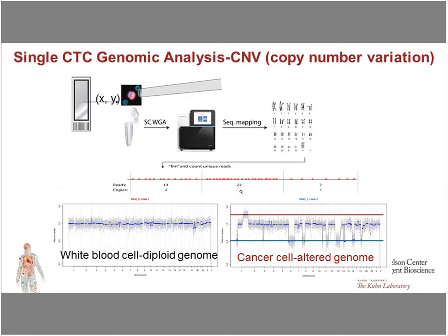Genomics. So once the candidate cell is identified with the coordinates, the micromanipulator is used to capture the cell and deposit it into a PCR tube for single-cell genomic analysis. Single-cell whole genome amplification is first done to increase the genetic material amount. We are using whole genome shallow sequencing for copy number profiling. The key part is dividing aligned reads into 5,000 bins, counting GC-adjusted counts in these bins, and calculating the ratio compared to the normal for each bin along the genome.